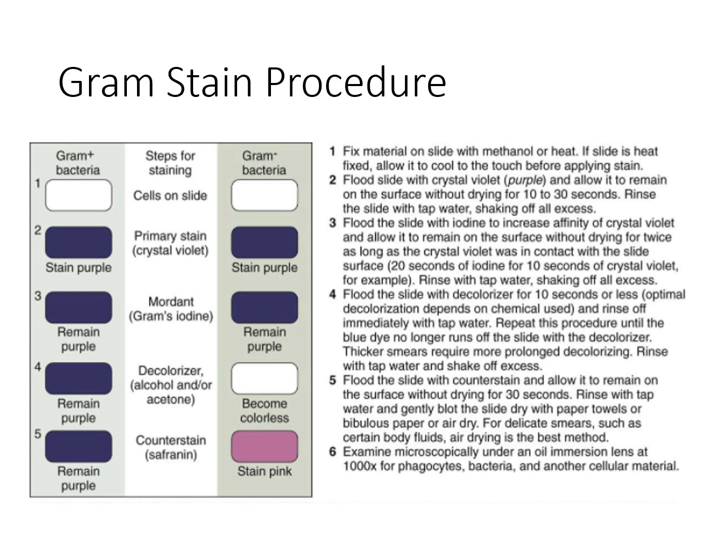For the gram stain procedure, you will prepare a slide with your organism straight off of the plate or with a direct culture, so from a sputum culture or swab. Once you have put that sample onto the slide, you allow it to dry, and then you fix that material to the slide either by a heat fix method or with something like methanol.